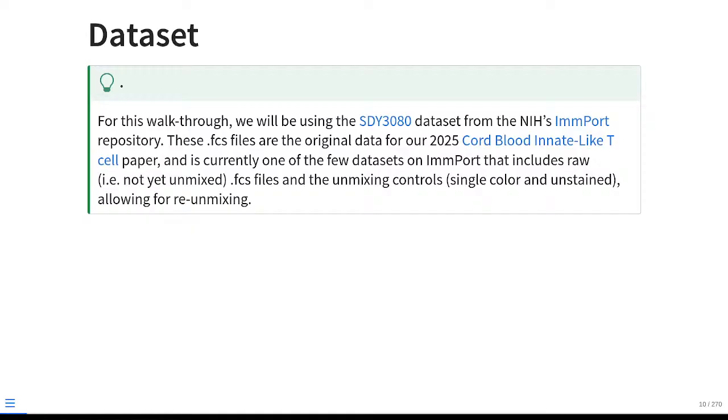in the last year. At CYTO, they mentioned some changes that should make it a little bit easier to work with going forward, but as of the time of this recording, it's not quite ready to where we need it to be. So, this particular dataset is one that I generated back in 2023.